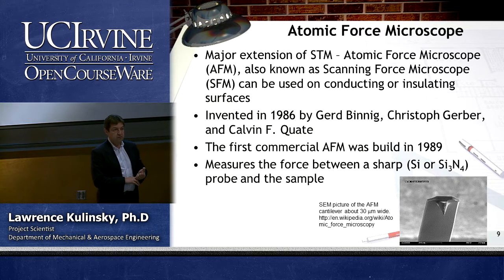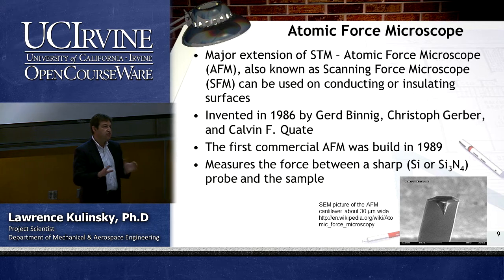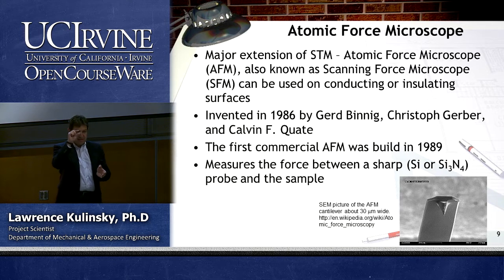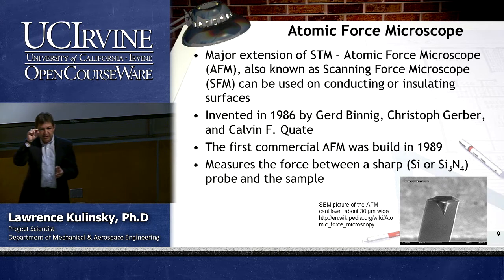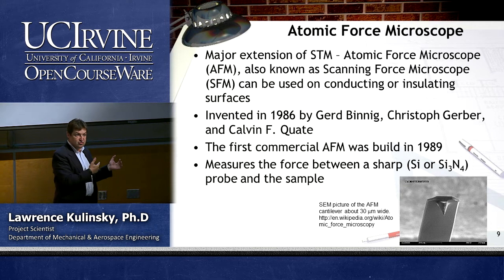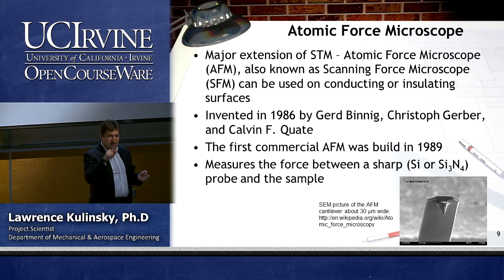Number two, it's actually very robust. It does not require vacuum. STM requires vacuum because, remember, the tunneling current, you need to have a very clean, nice gap with nothing in between. AFM, I will describe to you in a second, is just kind of a profilometer.